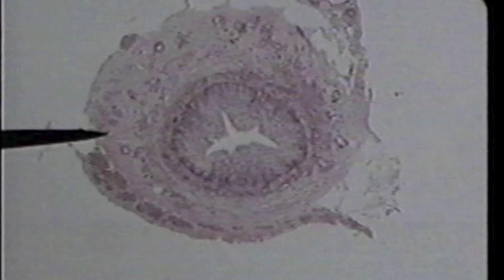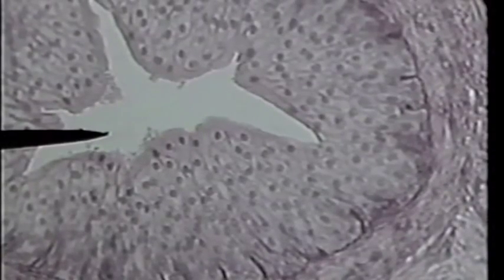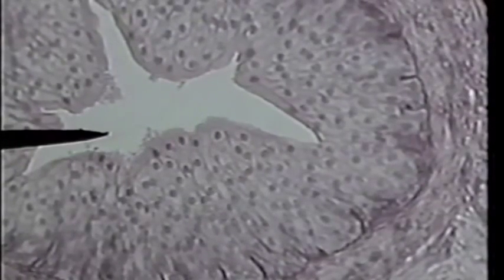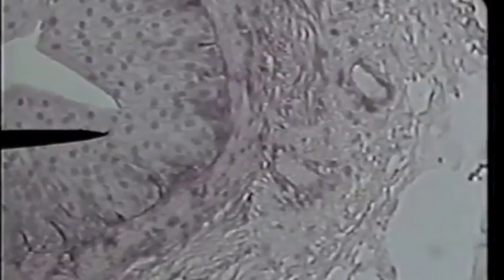On low power you can't see too much. We are about to go to high power. We're now looking at transitional epithelium on high power. The tip of the pointer is in the lumen of the transactional cut through the ureter.